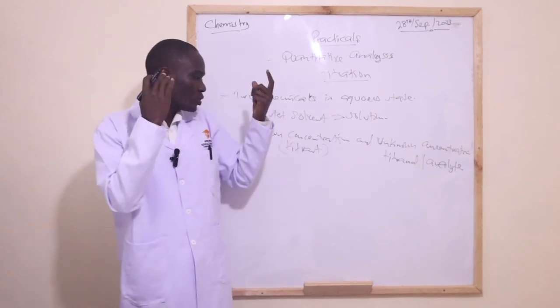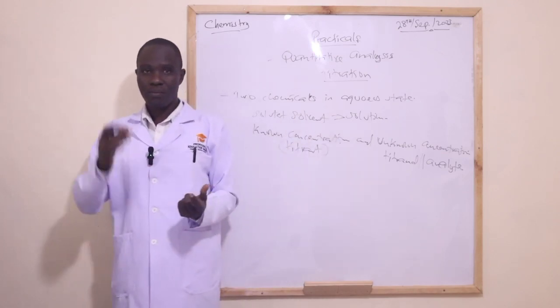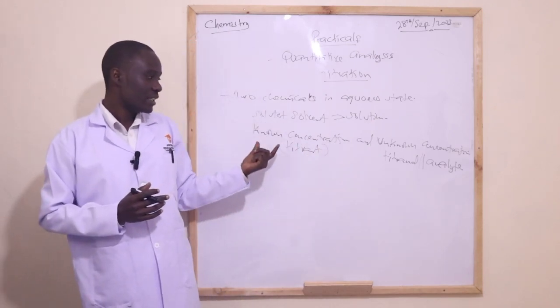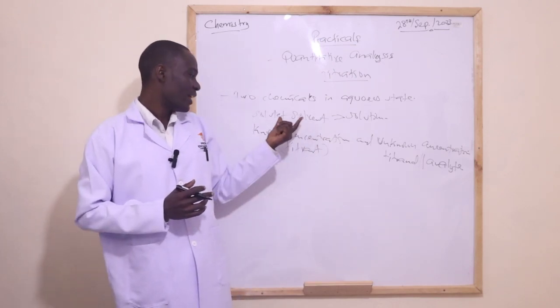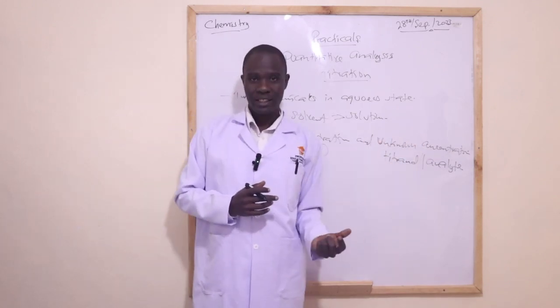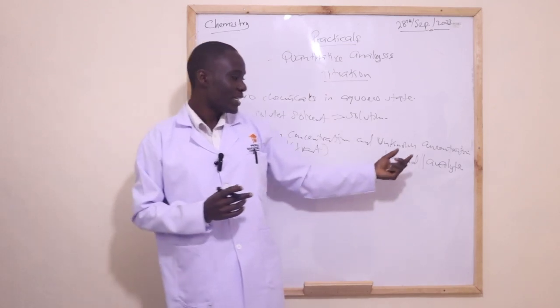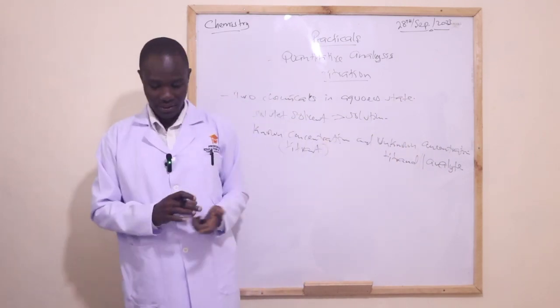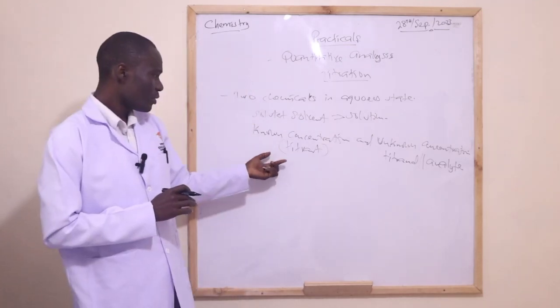Having known that two solutions of known and unknown concentrations are used, the reason why we titrate is to determine the unknown concentration, that is, the analyte. That's why we need to titrate.